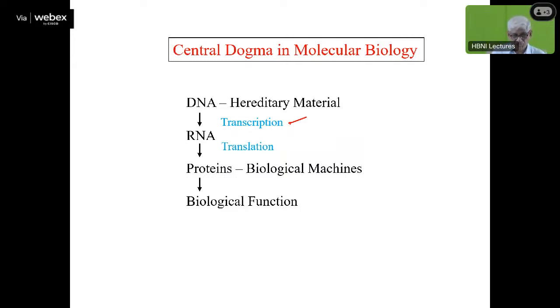So at the root of all of this is the structure of the individual molecules. How do we understand the function in terms of the structure of the molecule, or the structure and dynamics of the molecules? This has been an area of research for more than a century. In the initial years, and even now, X-ray crystallography has contributed a lot. For structure determination, X-ray crystallography has been a major force in elucidating the individual structures of molecules. In the case of DNA, it was the same, and also for RNA.